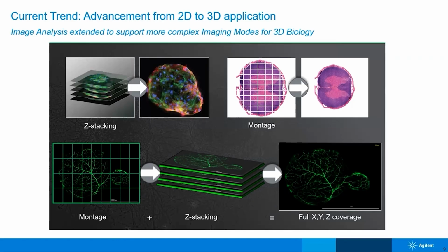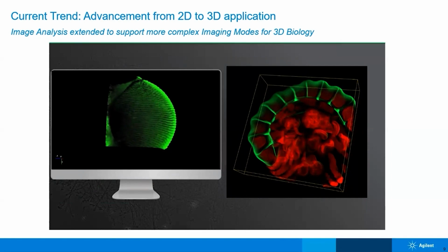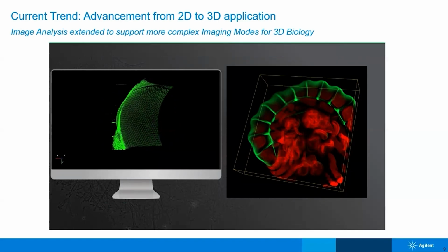With the introduction of the Cytation C10 recently, we also added a 3D viewer to visualize in 3D space what is going on in the biology.